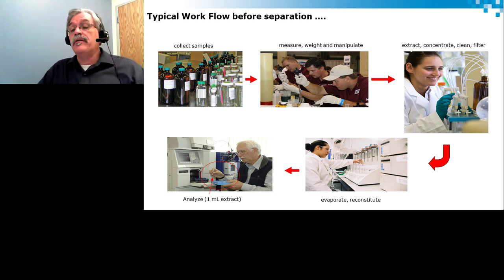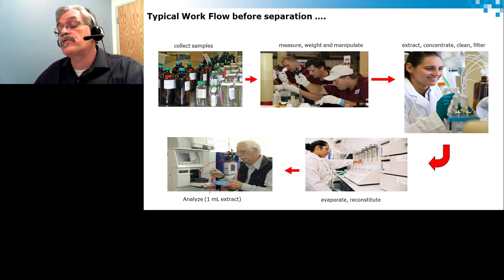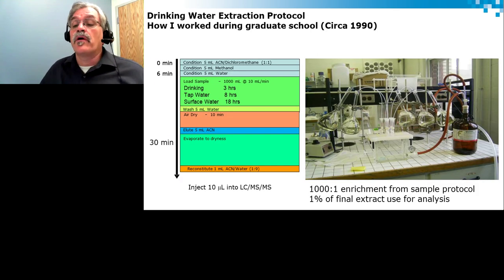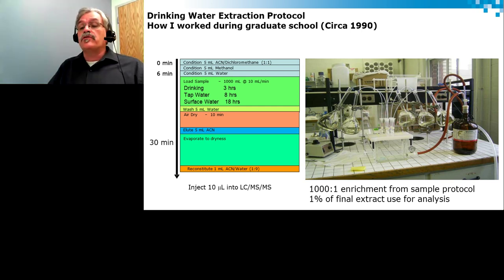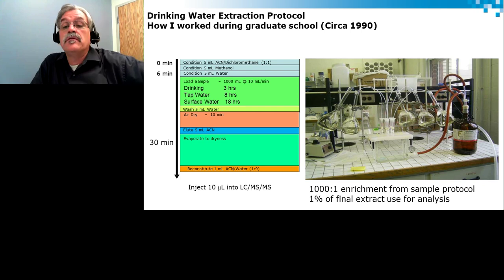That is a very lengthy extraction process. When I started my career back in the early 80s, extraction was done in a very lengthy process. We could spend hours, sometimes days, on extraction. This is an example of a setup from when solid phase extraction came on the market in the late 80s, early 90s.